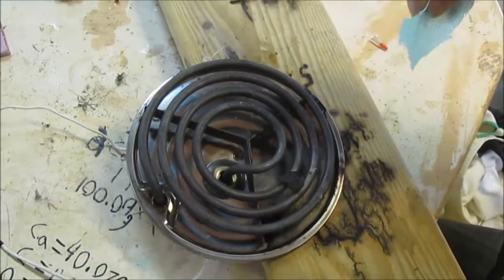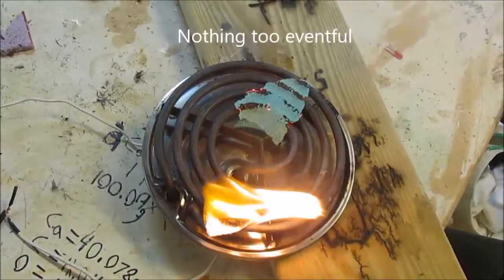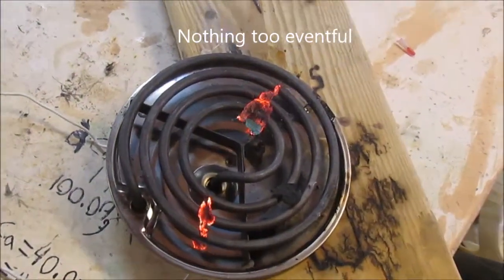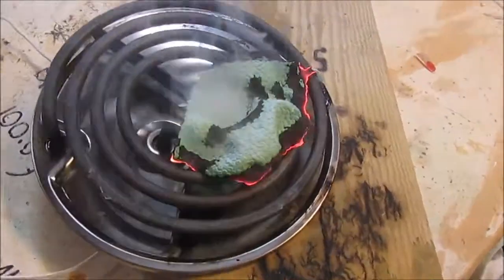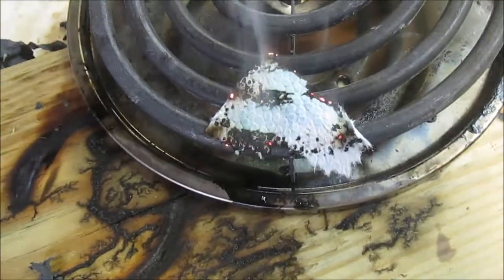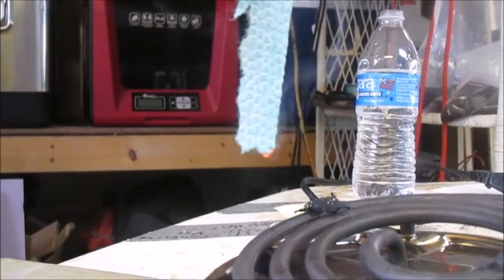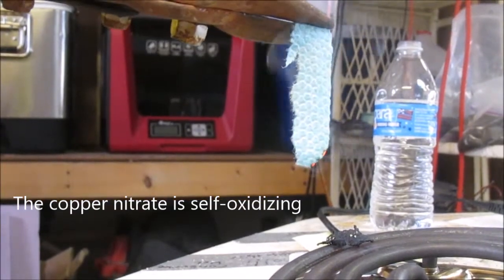Next, we tried the sample on a hot plate. Notably, the sample when brought towards a heat source — even without full contact — would burn and would continue to do so even without continual heating.